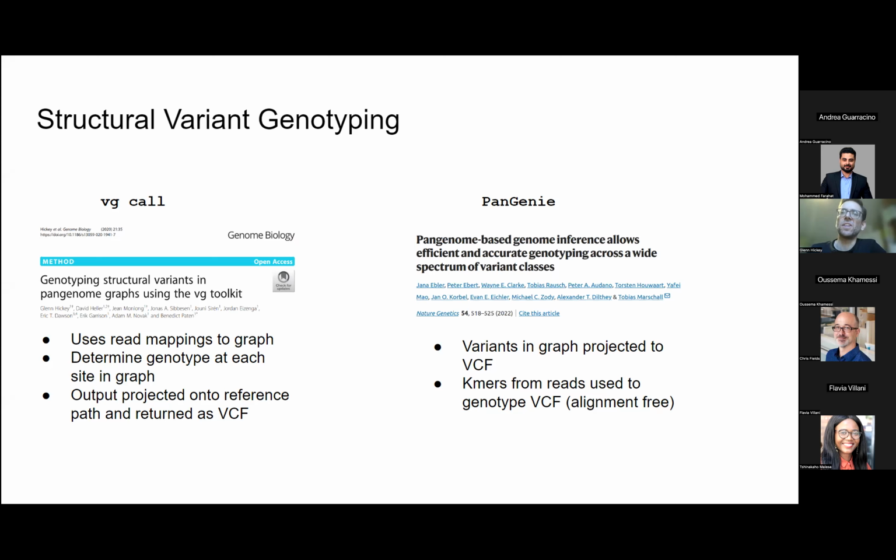Another interesting thing you could do with pangenome reference graphs is project between the genomes in the graph. One thing you could do with that is take your mapping to graphs. So if you use VG Giraffe to map your short reads to the graph, you could use this tool called VG Surject to transform your mappings to the graph to the mappings of any genome in the graph.